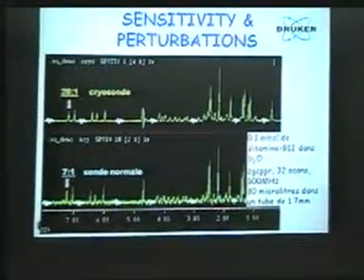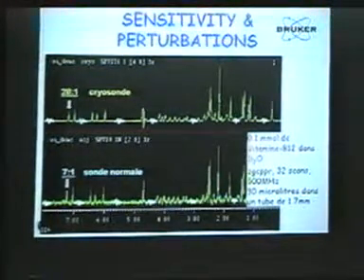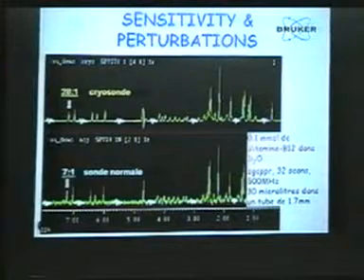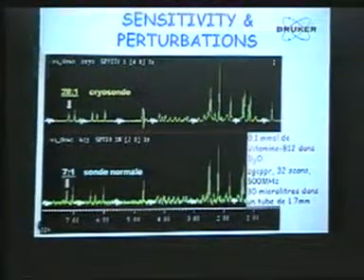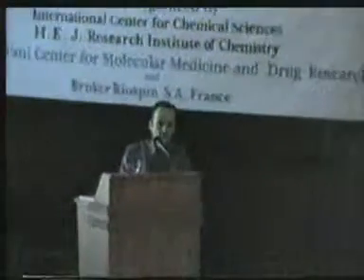So this development in probes, following the development in magnets, pushed Bruker to develop the spectrometers, the console. And the console that you will see coming in the next months, you will see that the electronic will be slightly different from the electronic that you have in console from 2 years ago, because the electronic has to be continuously developing because of this problem.